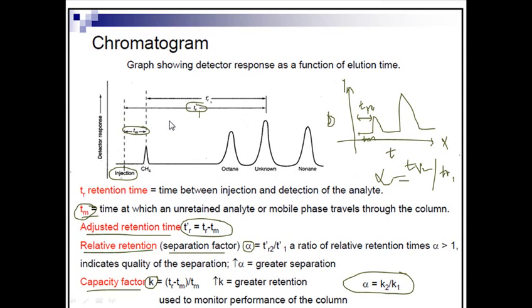After some time, when the analyte is detected, then we can have a peak. So whenever we have a peak, that means at that point the analyte is detected. For example, if we run a chromatogram, in this case, after 30 seconds it detects the first component, and for example after 102 seconds it detects the second compound.